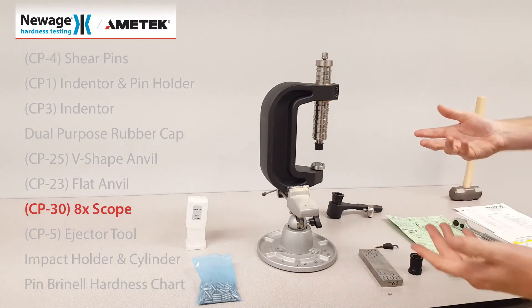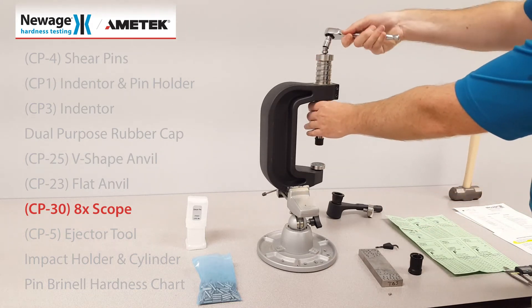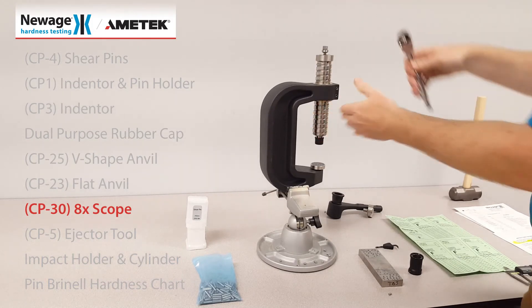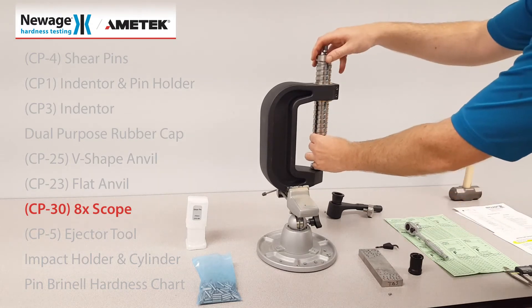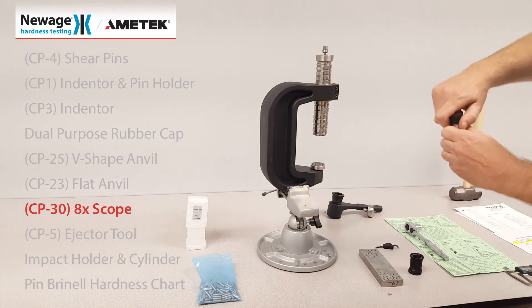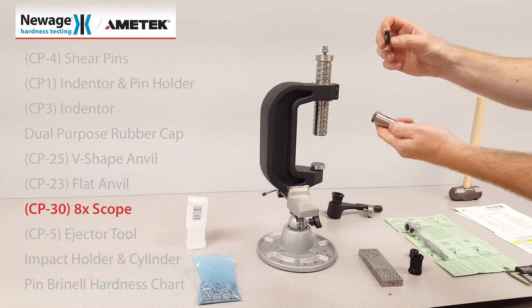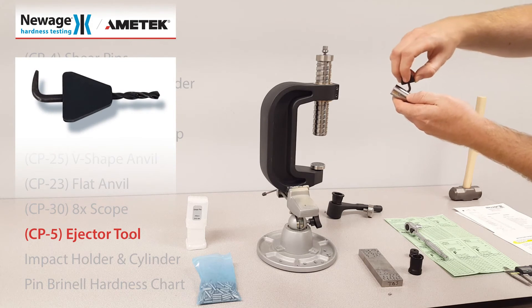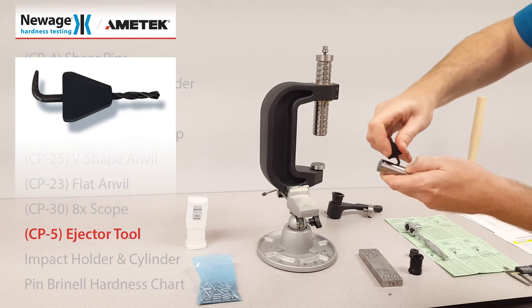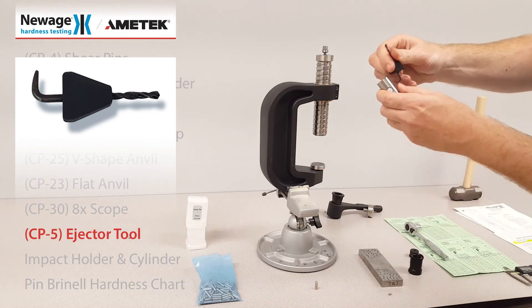When you are finished with your test, back off the larger screw as well as the drive screw for your next test, so as not to damage the point. Remove the indenter holder and remove the rubber cap. Included is an ejector tool which removes the indenter and the shear pin, which has now been broken.